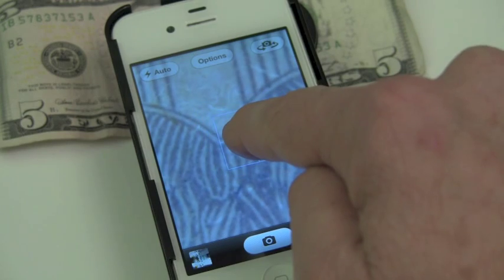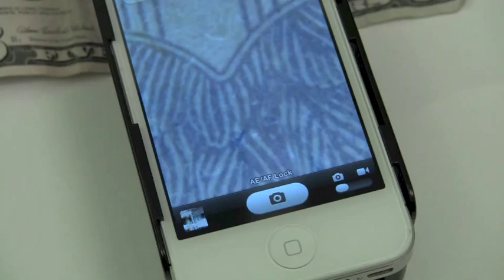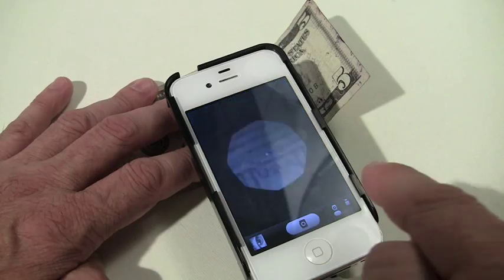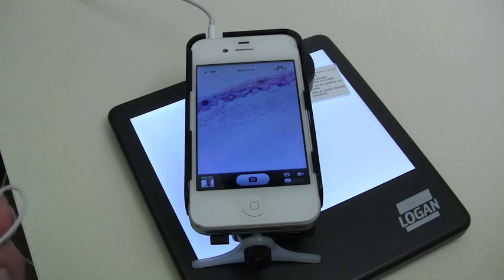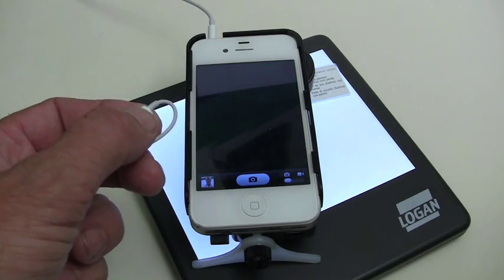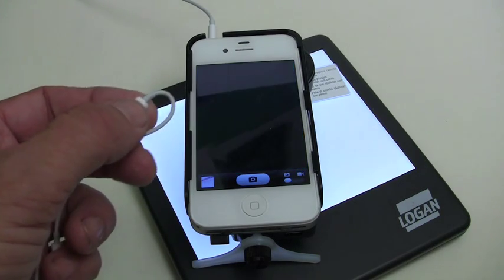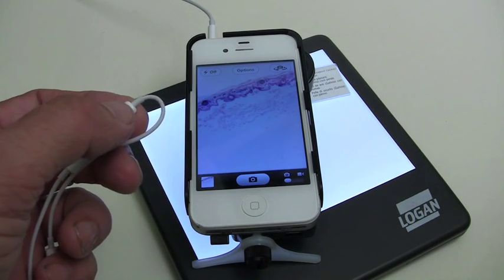Just tap on the screen to autofocus and tap and hold on the screen for a couple of seconds to lock your autofocus and auto exposure. Tap on the capture button on the screen to take an image, or to make sure you don't jar the iOS device by tapping, use the plus sign on your iOS earphones to take the photo without touching the screen.